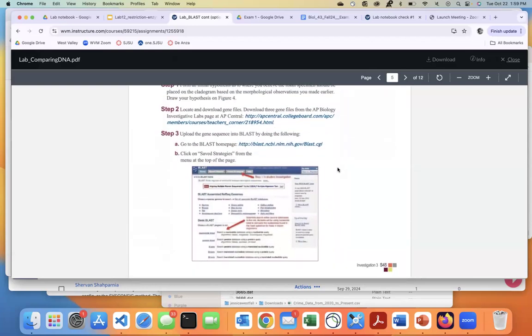So in this project, they were actually using it to try to find evolutionary relationships. We're not really looking at it for evolutionary purposes so much right now. We're just trying to explore things, but I wanted to put this on here so that you would have these screen grabs that kind of show you how they went about it. So they're using BLAST here.